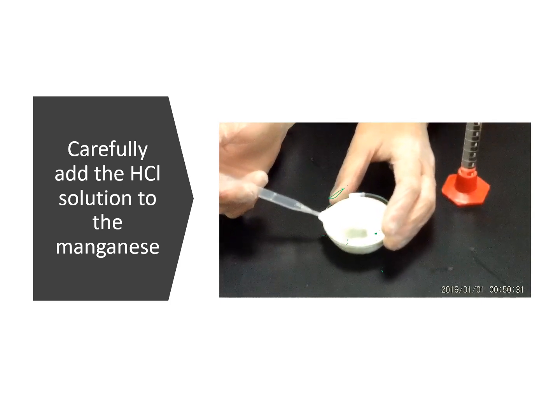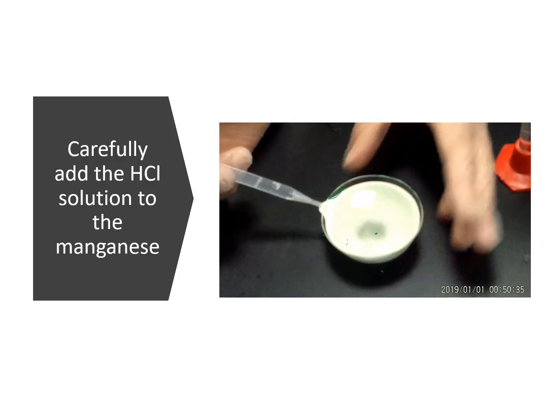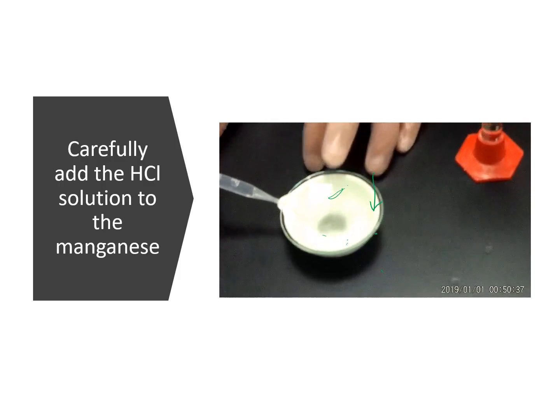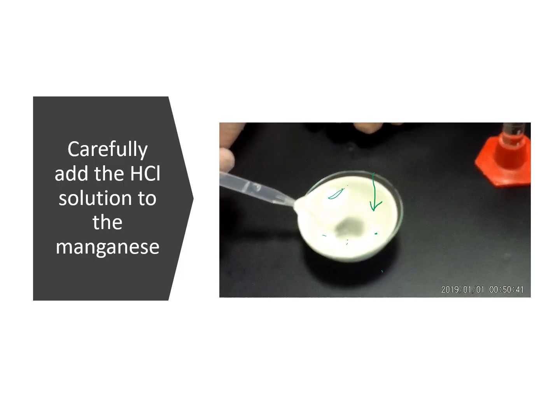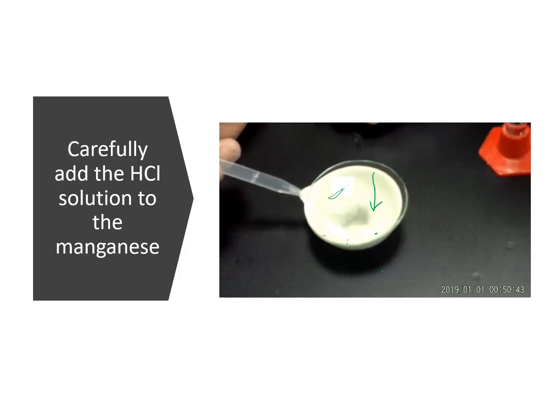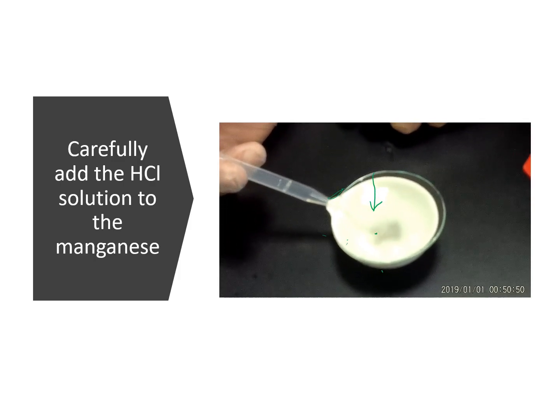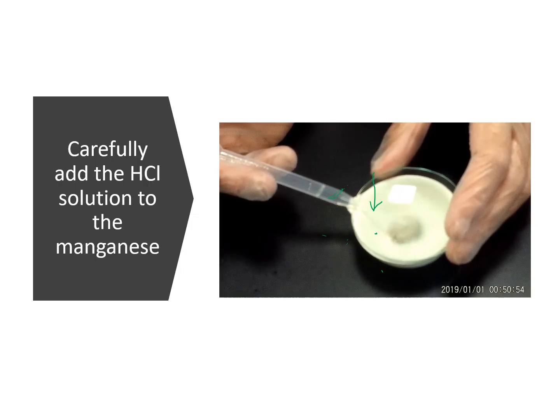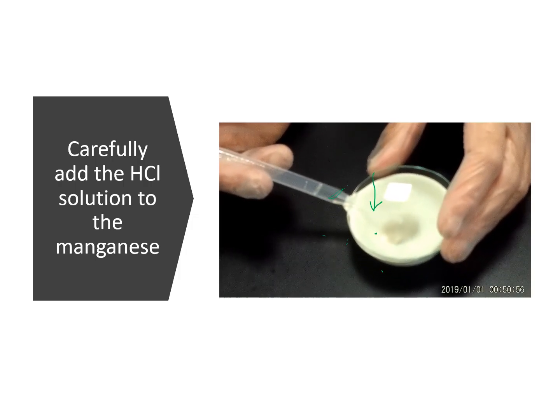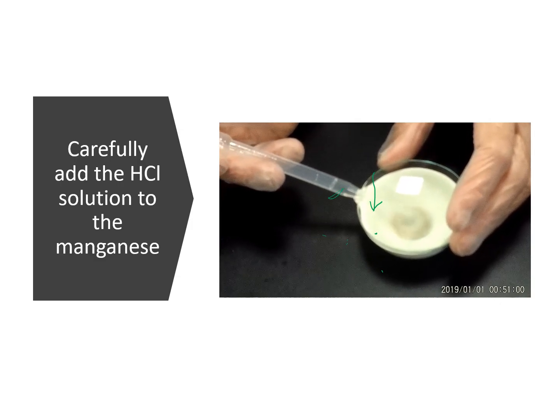You can see that there's a vigorous reaction. The reason you want the watch glass is you can already see on top of the watch glass the steam and some of your product has splattered onto the top of the watch glass. So just continue to add dropwise until you've added all 8 milliliters of your 6 molar hydrochloric acid.